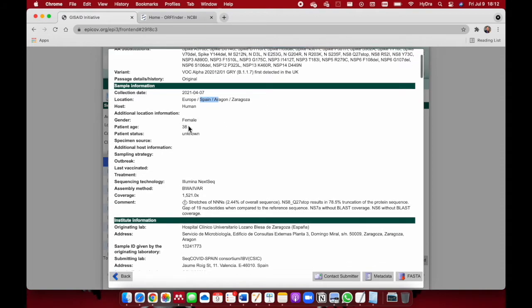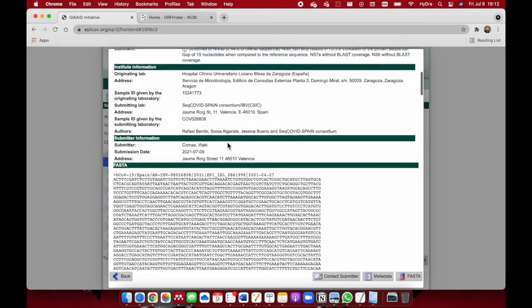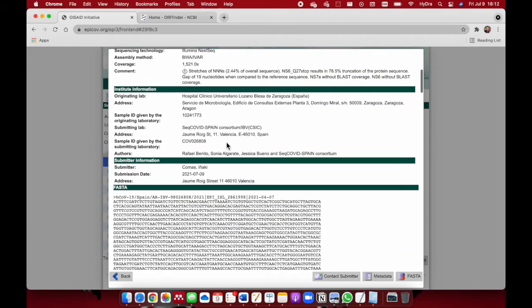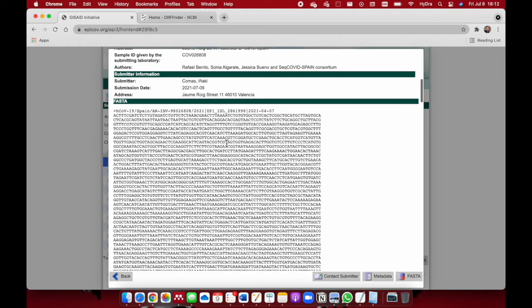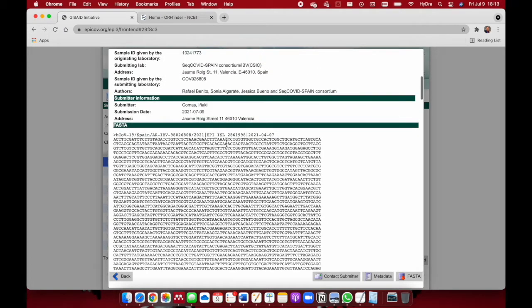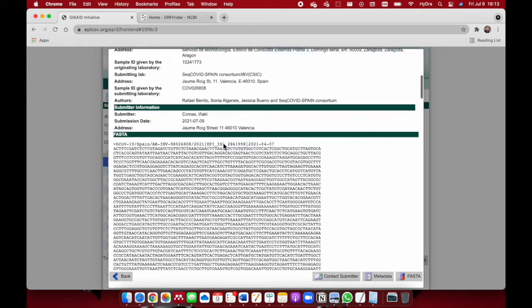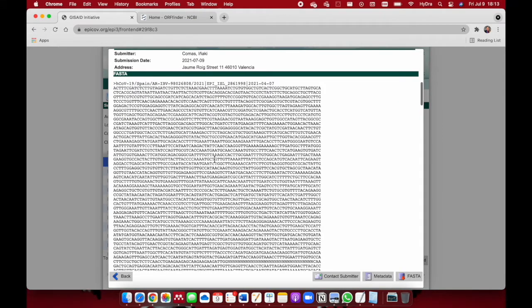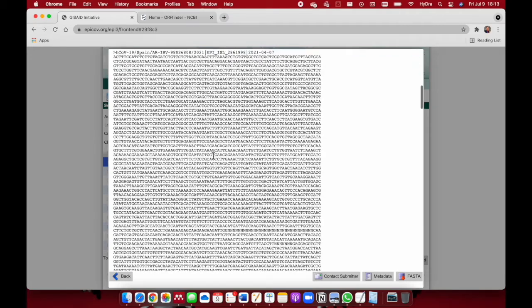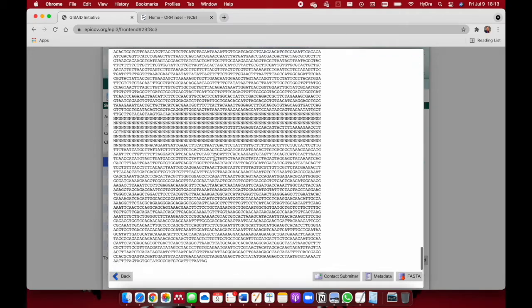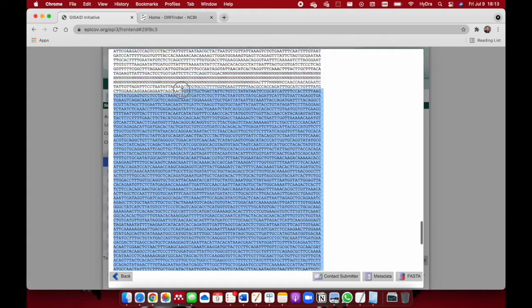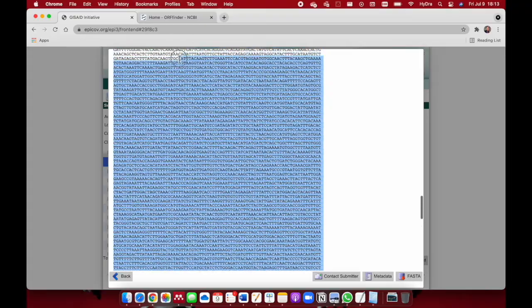It was taken from a female patient with the age of 38. This person tested positive for COVID-19, and they took that sample and did some sequencing and obtained the nucleotide sequence of that coronavirus. This is the whole genomic sequence that makes up the entire COVID-19 virus they isolated from that lady.